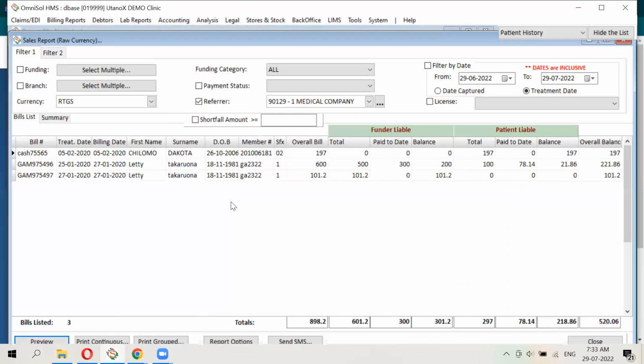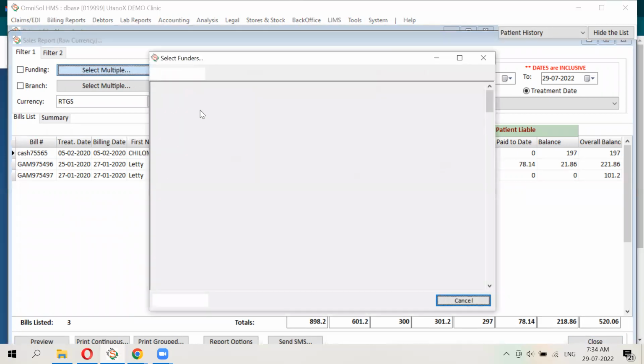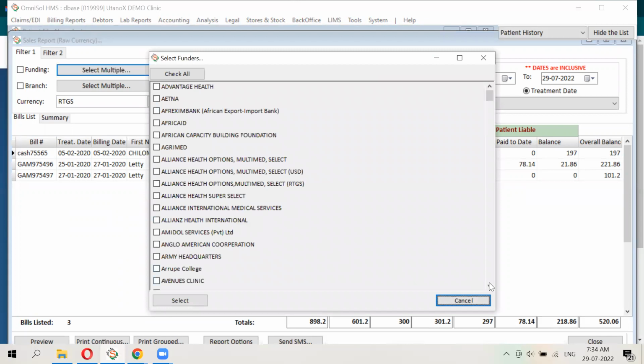Okay. So it can do statistics. Okay. So I can filter to say, okay, fine, Dr. Nzua had this many patients, this many requests from BPOMAS patients. So we're expecting this much. It can do those filtering, right? Yes, because under funding, you also can pick the funders that you're interested in for that particular report.